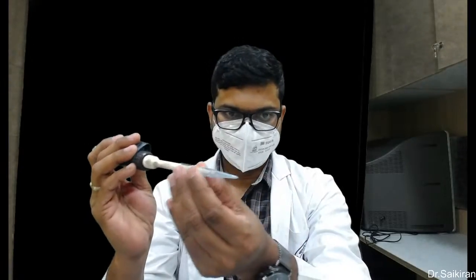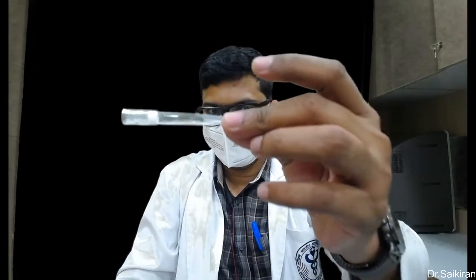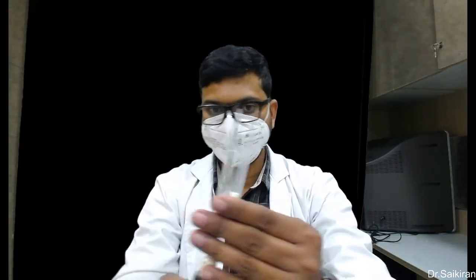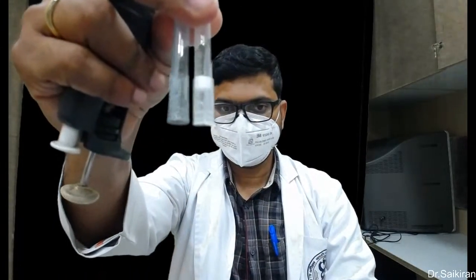So before that, I'll be showing, this is the pipette. This is the pipette tip with which we take all the desired liquids. And there is one thing called this. There is a filter here in the pipette tip. The pipette tips come in the normal type and with a filter in the unit. This filter will prevent contamination.